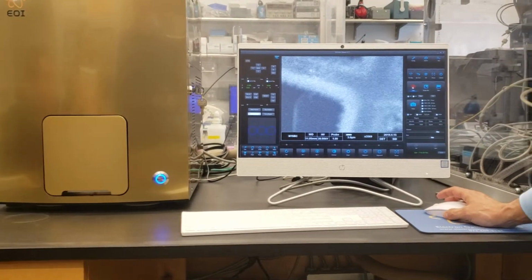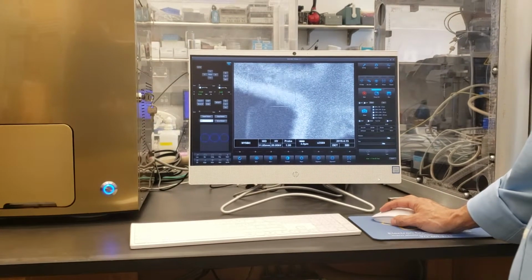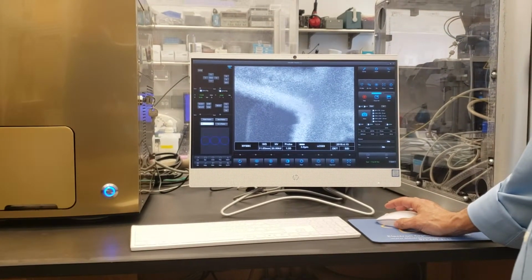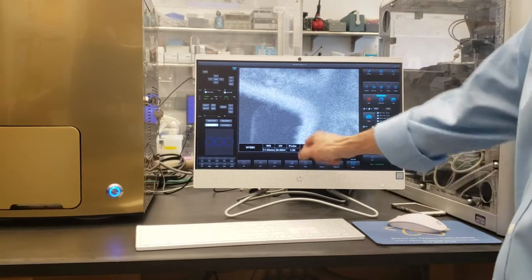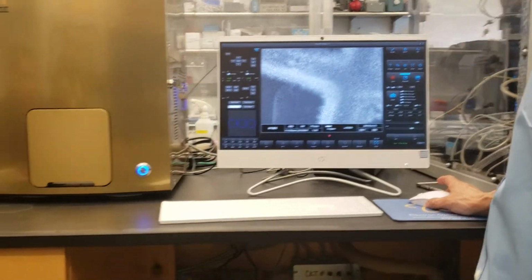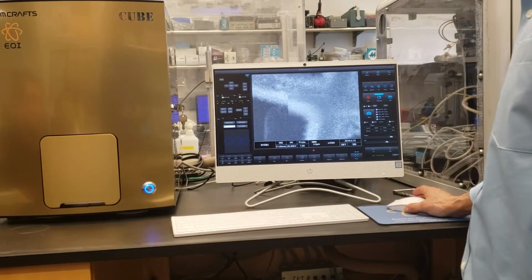So I hit run initially, right? And then the next thing I do is I throw up a focus window. See this focus window came up, and I can move this wherever I want it to be. So I can just move that around. And see down here where it says focus? I just need to click on that. See how it became a left arrow? And so if I change my slider in that left arrow in one direction or the other, right?